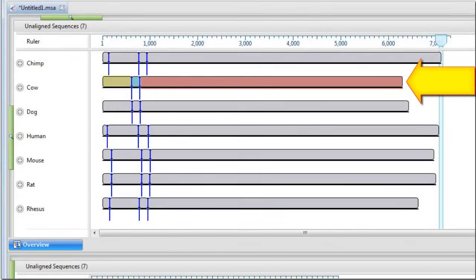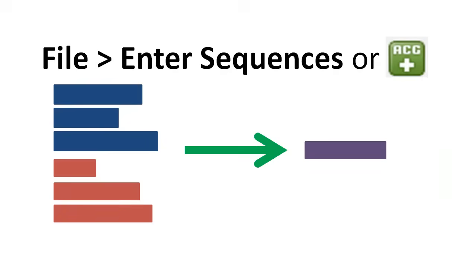Suppose we want to string together the consensus sequences from all of the contigs in an assembly, or chromosomes in a genome, or exons in a gene.